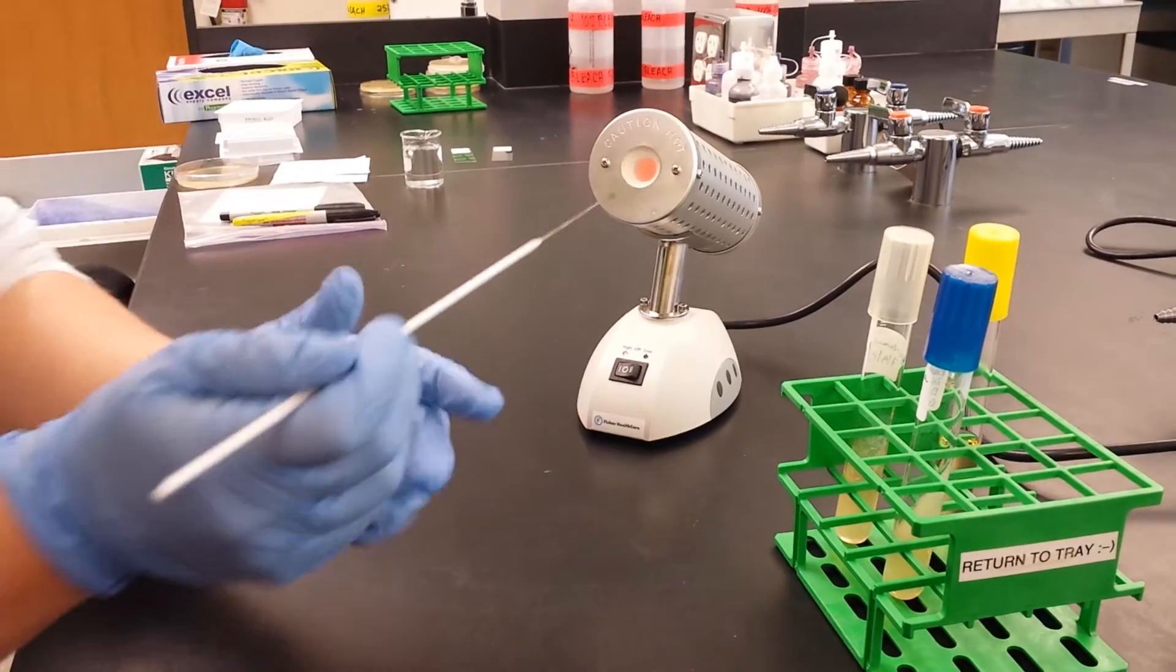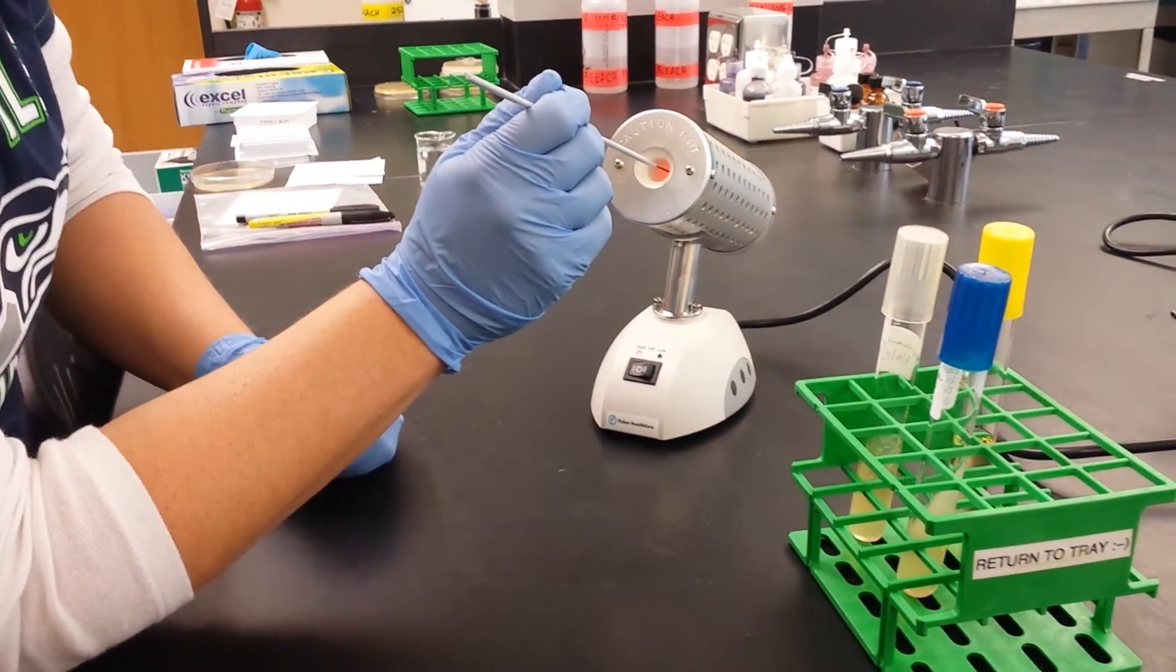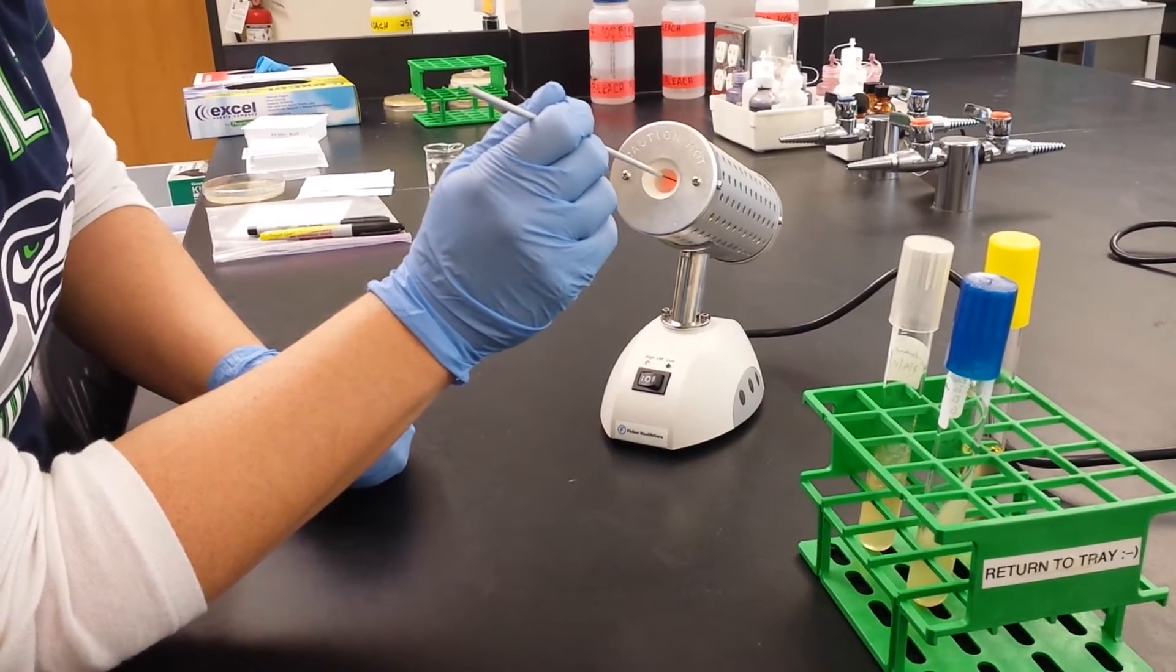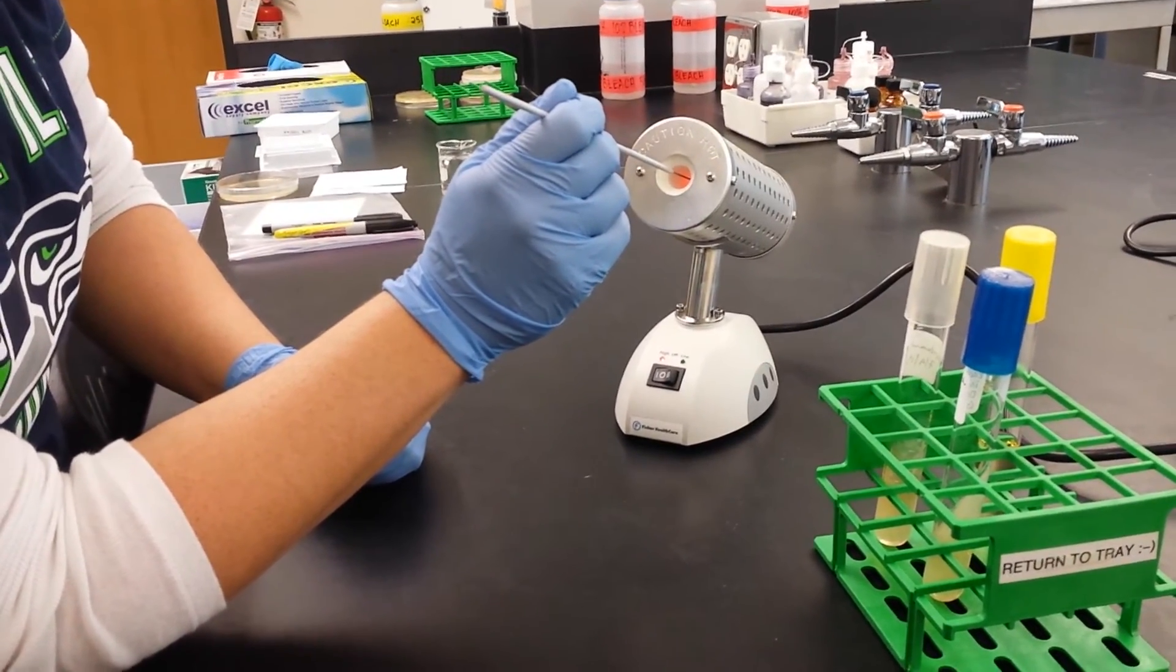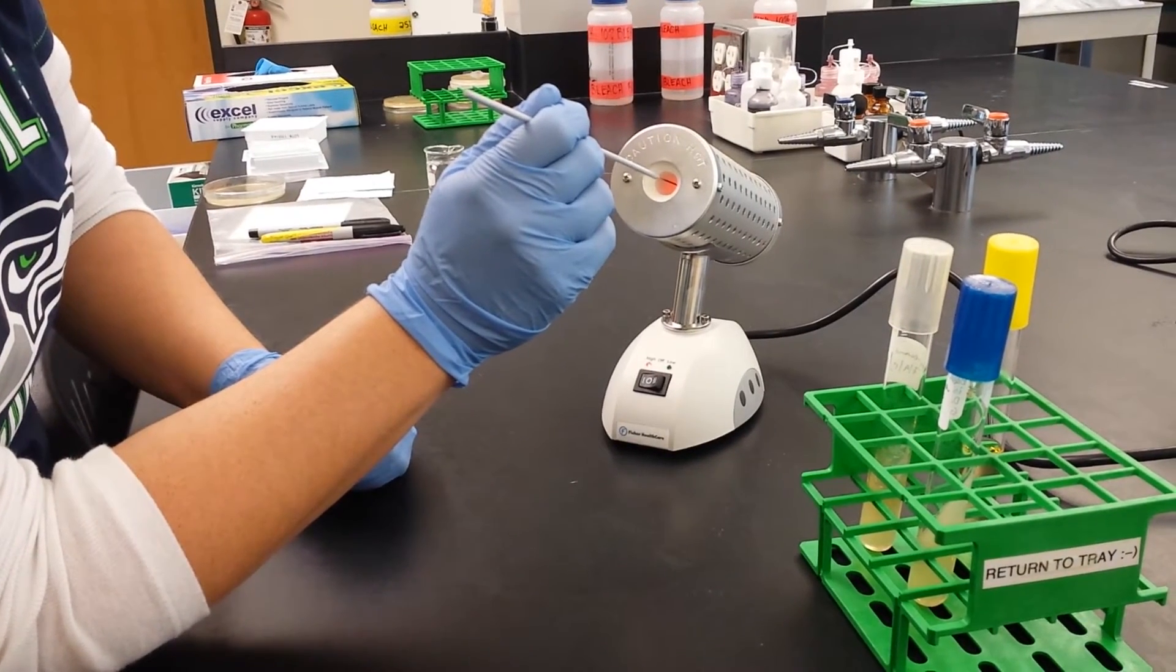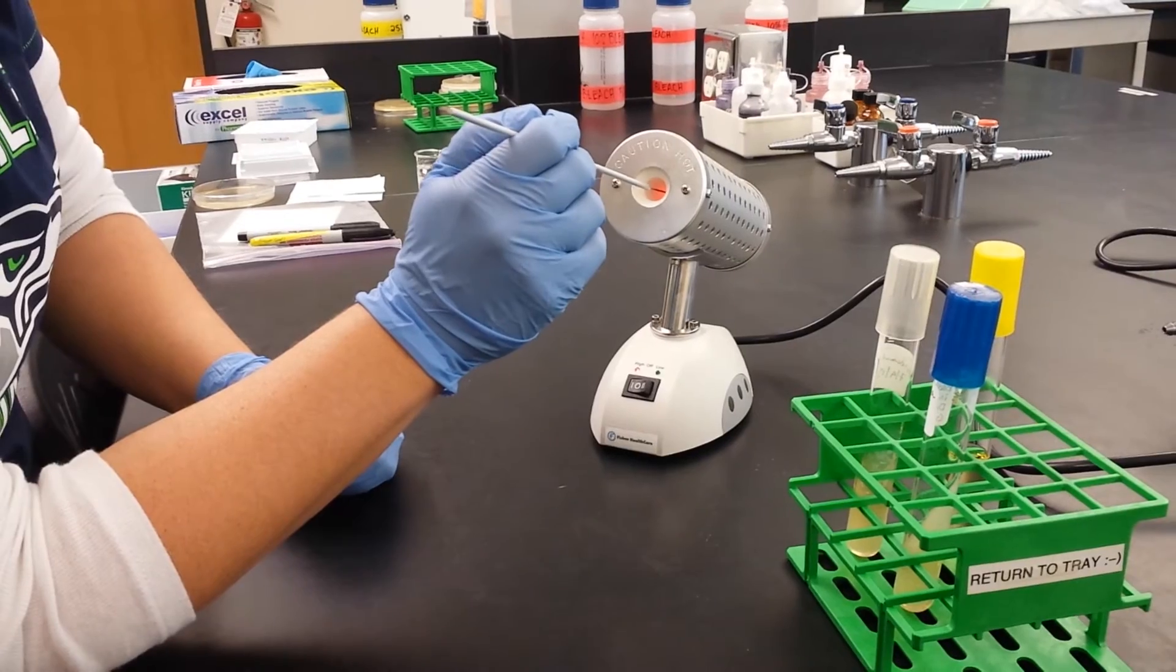So into the Bacti loop it goes again. Put it in there and count to 10. 1001, 1002, 1003, 1004, 1005, 1006, 1007, 1008, 1009, 1010.